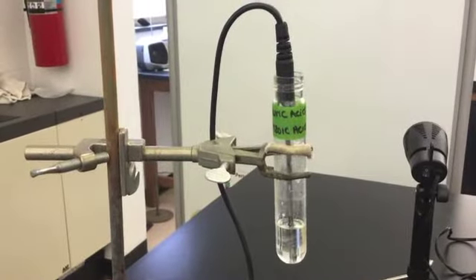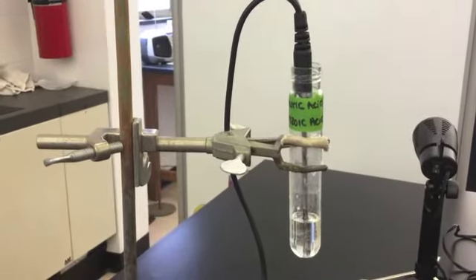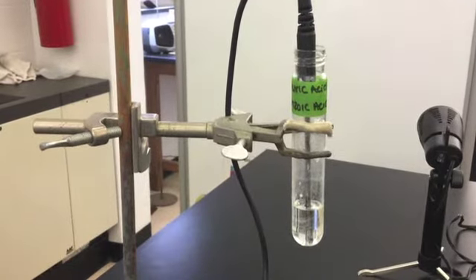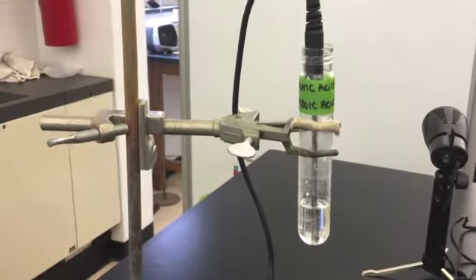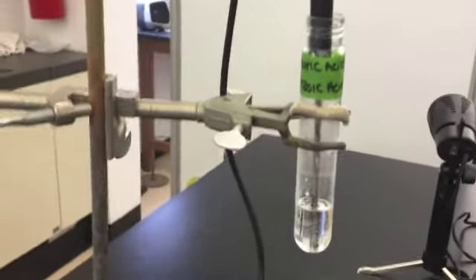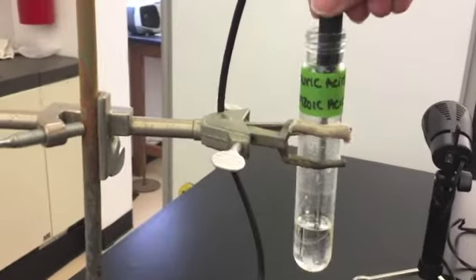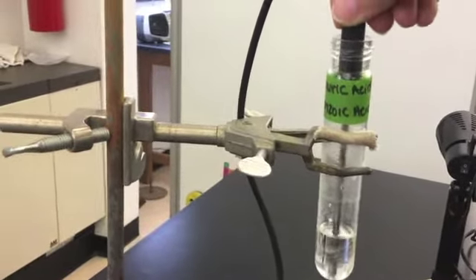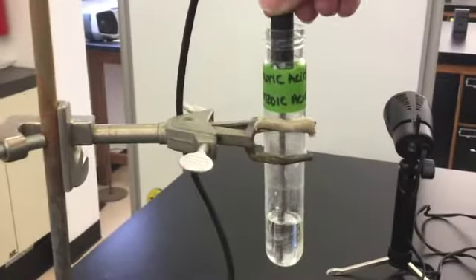Once your mixture is completely melted, it is important to stir thoroughly. We want to make sure that the concentration of benzoic acid and lauric acid is the same throughout. If this is the first time that this mixture has been heated, there is a decent chance that the benzoic acid is not spread evenly throughout the mixture.